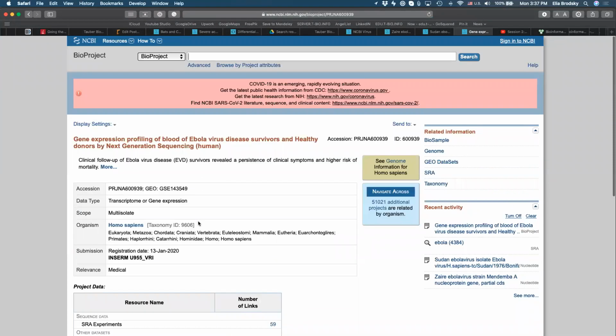All right. Okay, so are there any other questions? Can we, I see that the top of the screen changed from SRA to bioproject. So when we're looking for a bioproject initially, can we just go straight to the bioproject, change it to bioproject and type in human?